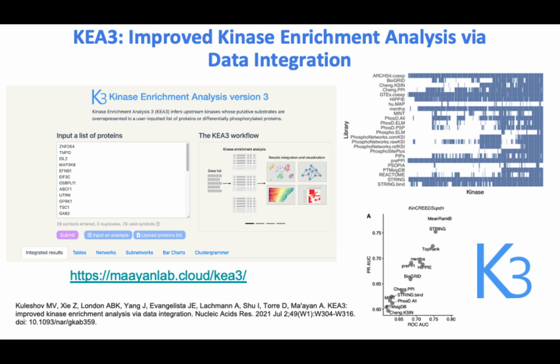Hey, Giacomo, does KEA3 include CPTAC data or just literature? Sorry, what includes CPTAC data? This tool, KEA3, does it include CPTAC data or is it just literature based? No, it doesn't include CPTAC data specifically, but in this top right figure here, these are some of the databases that it does include. So this is BioGRID, Reactome, a variety of phospho or kinase substrate databases, as well as those from literature. So it's a combination of many different sources. Got it. Thank you. Yep.